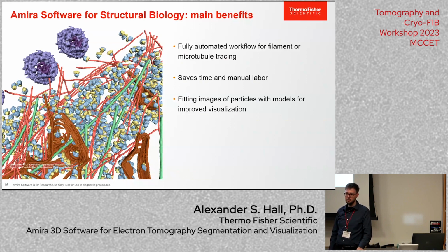So the ideal model would be trained using a very large number of data sets with similar features in them, but different imaging conditions, maybe different microenvironments. I'm not sure what the right term is, but I like where your mind's at, because I would like that to exist too, to greatly accelerate this whole process. We're not quite there yet, but this is also kind of a call to action.